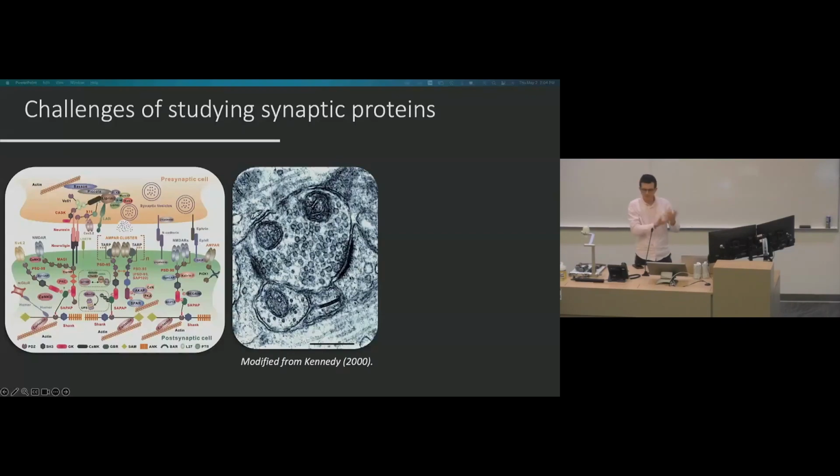But the limitation is that we cannot really target specific proteins, or you can do it with gold particles, but only one protein at a time. You cannot really do multiplexing. Also, the volume that you can image, acquire, and analyze is quite small if you want to spend a reasonable amount of time and not years processing.